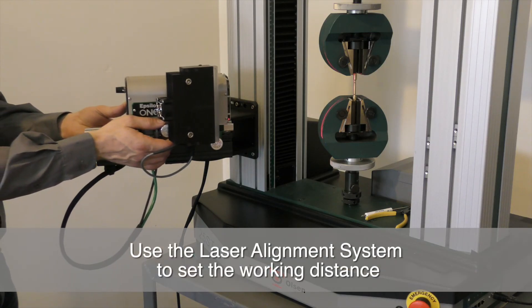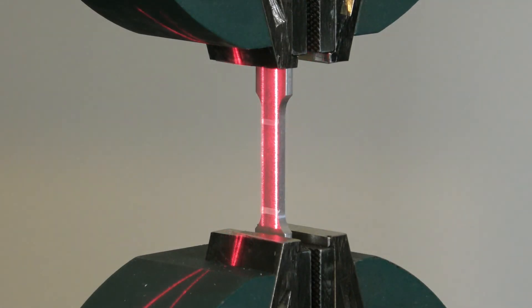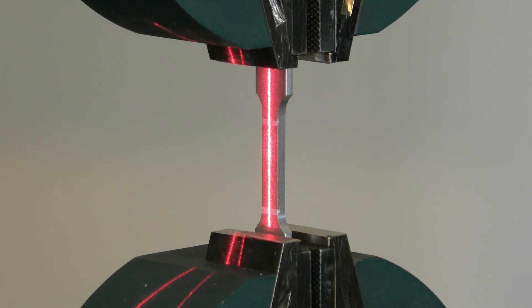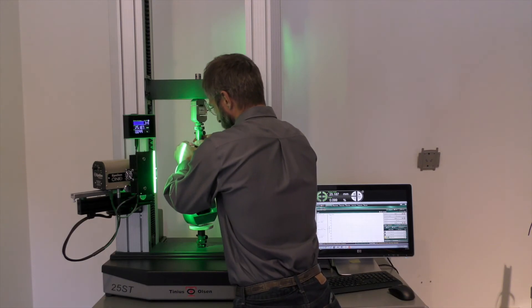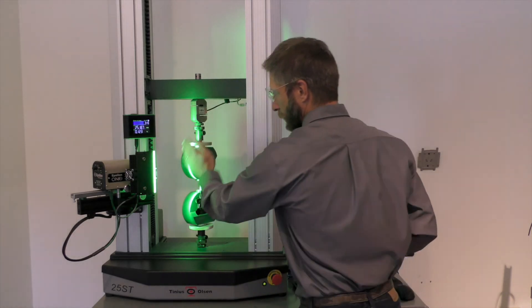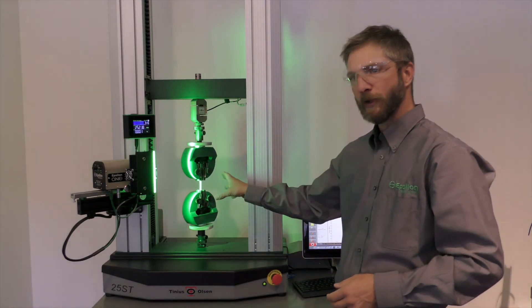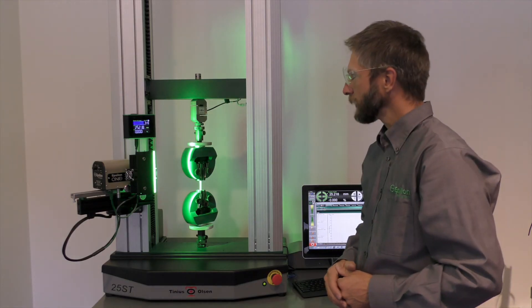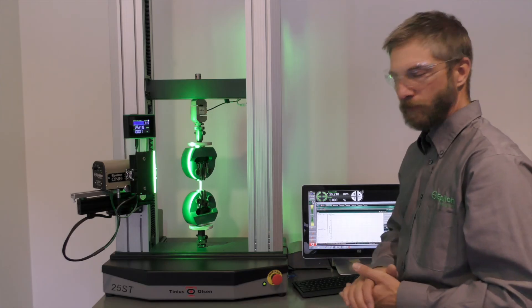We can use our laser alignment system to check the working distance and alignment of the specimen. That looks just right — the laser lines are right on top of each other, forming one line, vertical and centered on the specimen. With a mechanical extensometer, we would need to remove the zero pin at this time. With the Epsilon-1, I'm going to reset the gauge length with a wave of my hand. The optics have measured the mark-to-mark gauge length on the specimen, and now I'm going to communicate the strain to my test frame over an analog output.